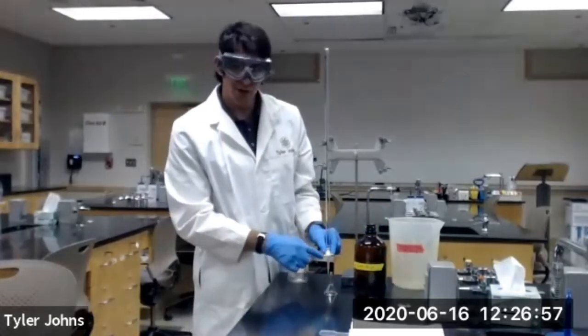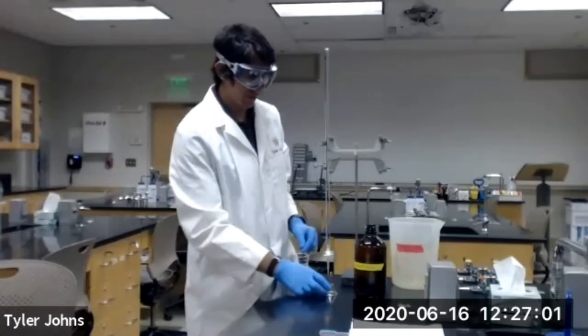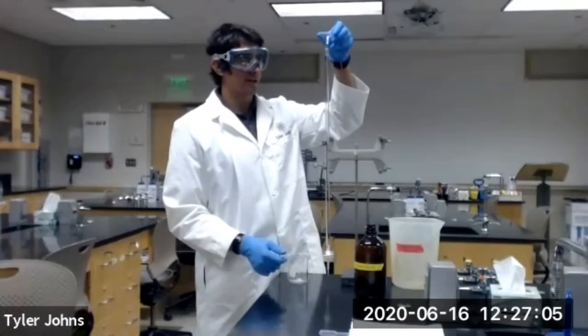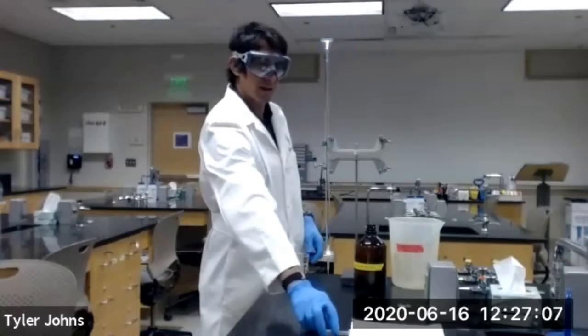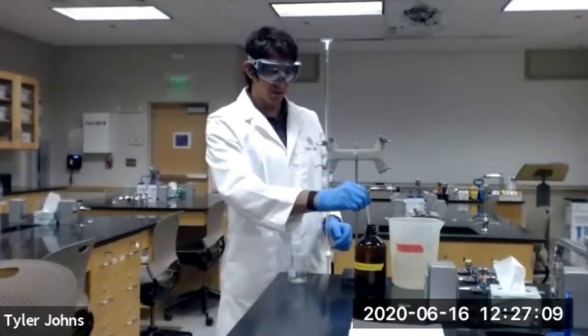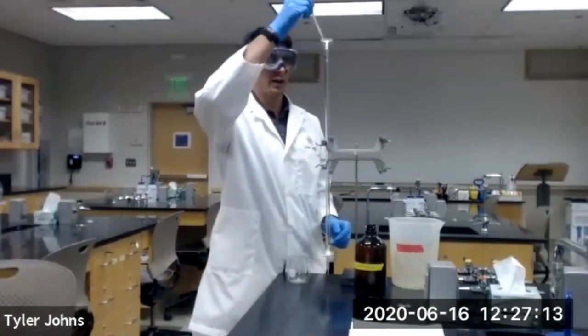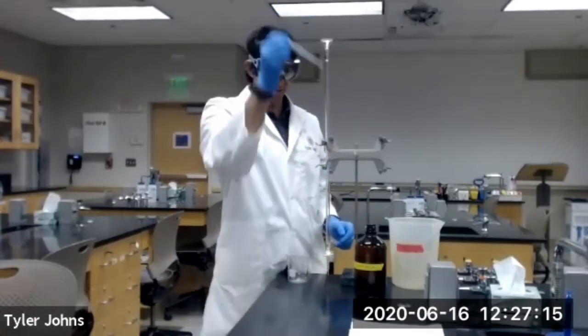We want to make sure that our stopcock is in the closed position on our burette. We're going to use a funnel, so we'll insert the funnel in the top of the burette. And then we're going to take 5 milliliters of our standard solution, the sodium thiosulfate, and add it to our burette.